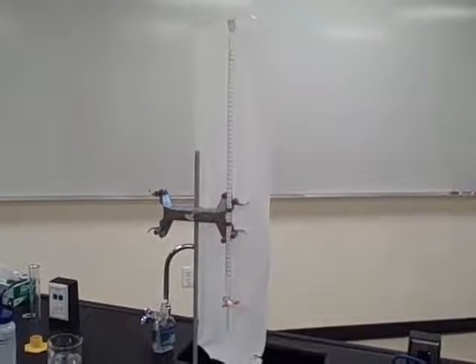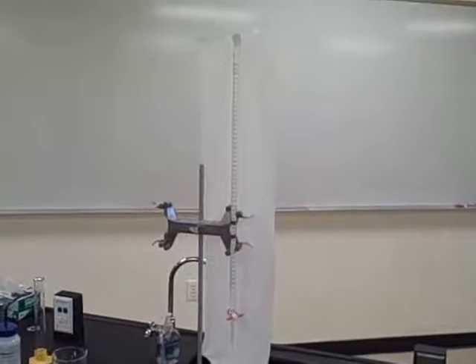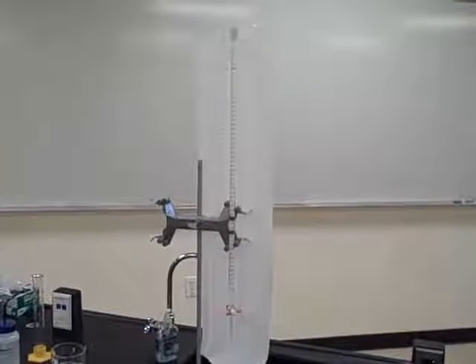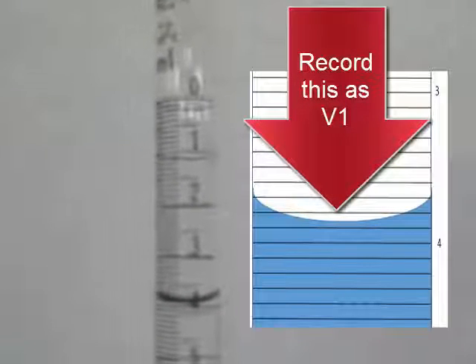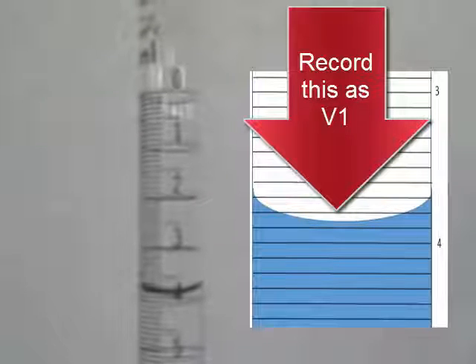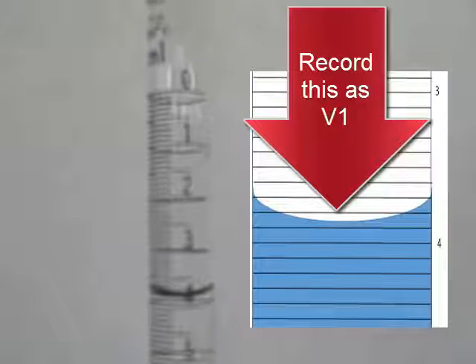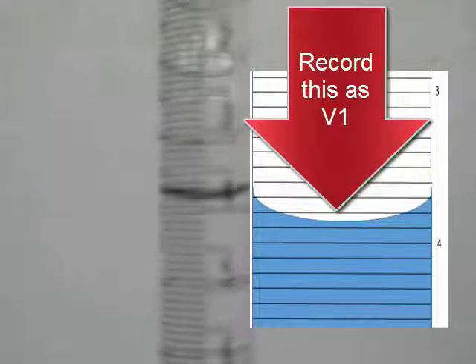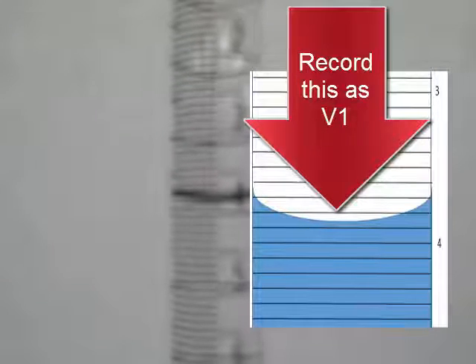Now we'll use the burette to measure volumes of salt water. Notice that the solution level is not at zero. When you use a burette, the solution level does not need to be at a particular starting value. Now record the initial volume, or V1, to the correct decimal place.